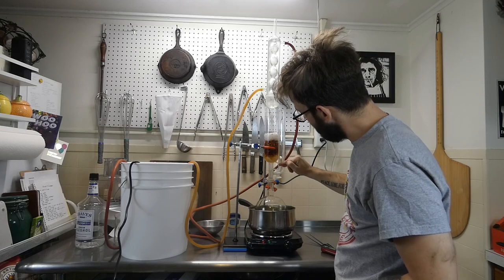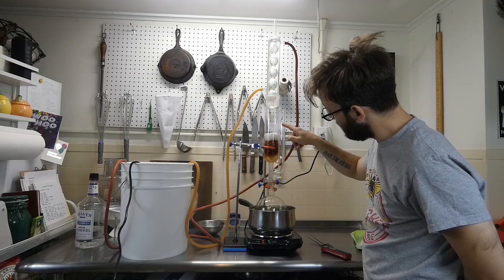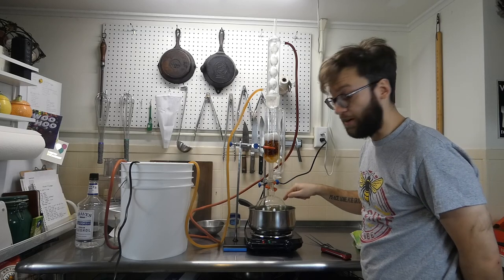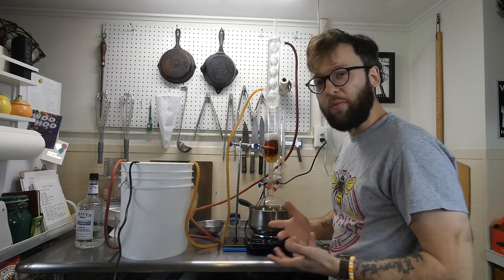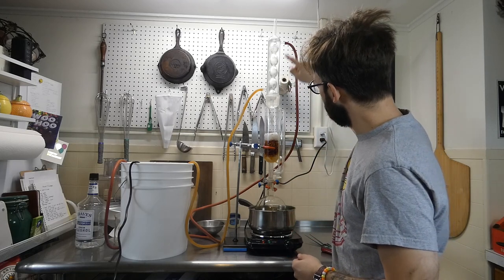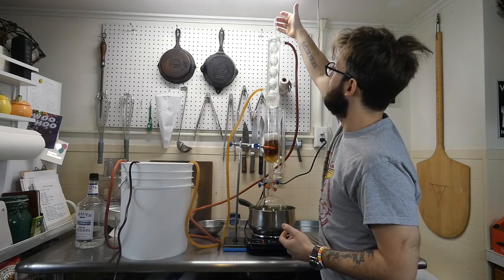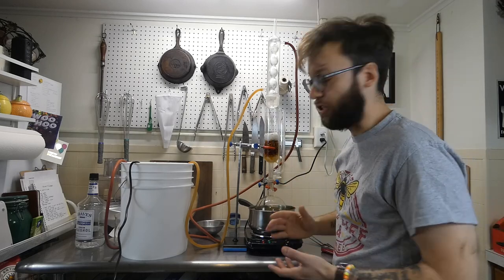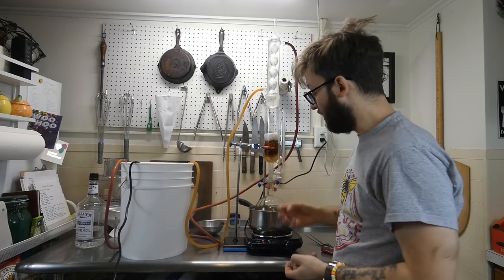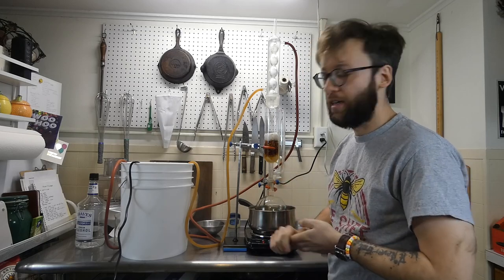And as it works its way down, this tube here is going to start filling up slowly, slowly, slowly, and then all of a sudden it's going to release back into here and go down into the flask with the rest of the ethanol. Now this is kind of cool because unlike a normal distillation or extraction, this reuses the ethanol and continuously keeps it going throughout the whole thing. There's barely any waste. Obviously there's going to be a little waste because there's a vent up top, but nothing major, which is awesome. Because then after we do the extraction, we're going to distill the ethanol out of the extract and we'll have an almost pure capsaicin extract.